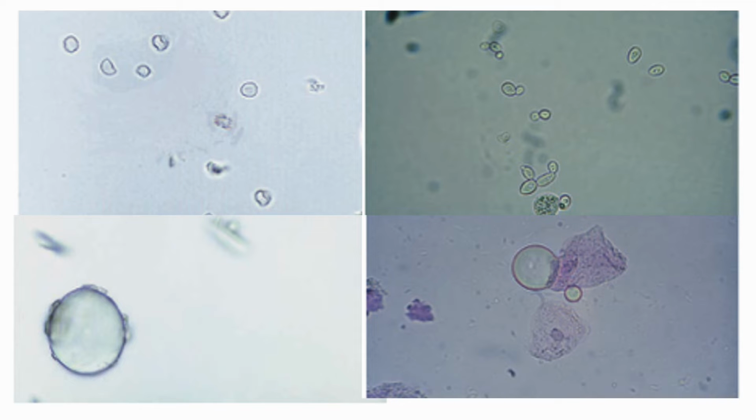So it's important that the dysmorphic red cells be distinguished from their common mimics, like yeast cells, air bubbles, and even oil droplets. Dysmorphic red cells are seen here in the left upper quadrant, while you have the yeast cells in the right upper quadrant. Notice the presence of budding forms that aids in distinguishing them from the red cells. You have the air bubble in the left lower quadrant. Notice the absence of formed elements in the area of focus. And in the right lower quadrant, we have a stained squamous epithelial cell adjacent to oil droplets.